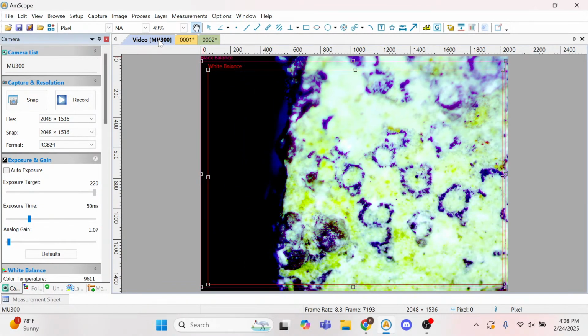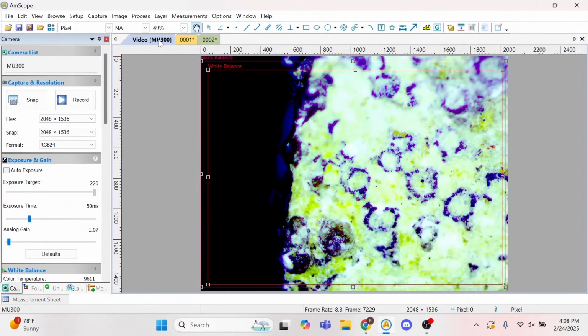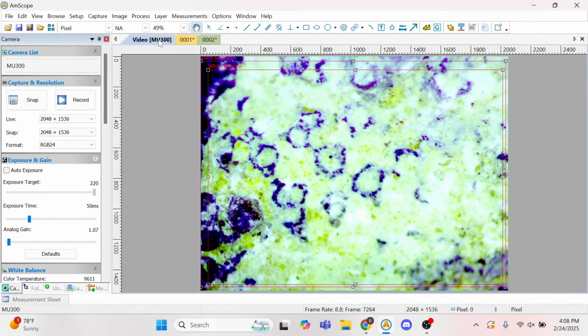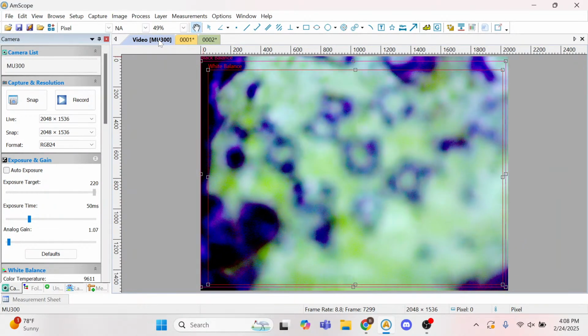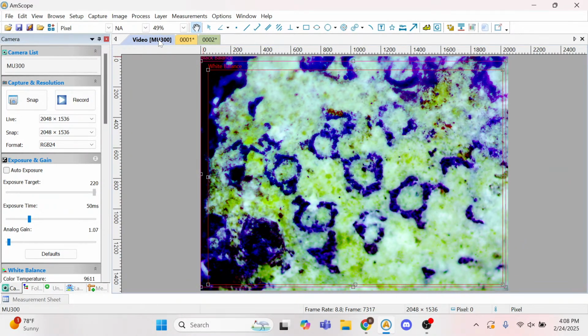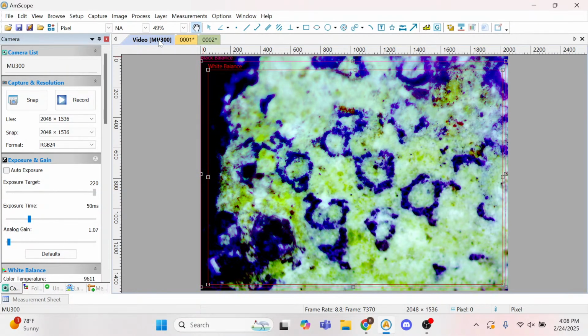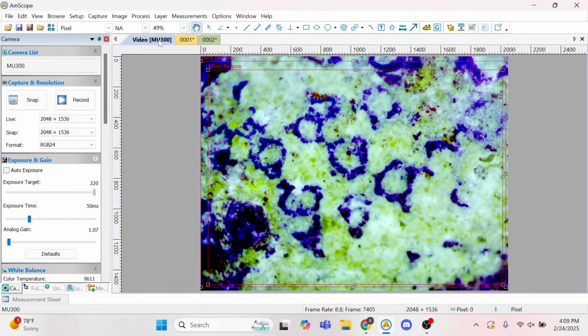There's a cool pattern right there. It's a really interesting cluster. Right there in the middle, you can really see, I think, that might just be a speck, but that really looks like you can see directly where that air pore is. That's really interesting.